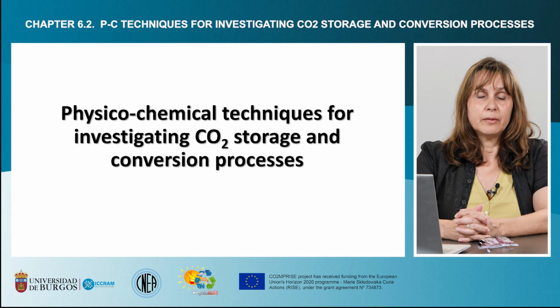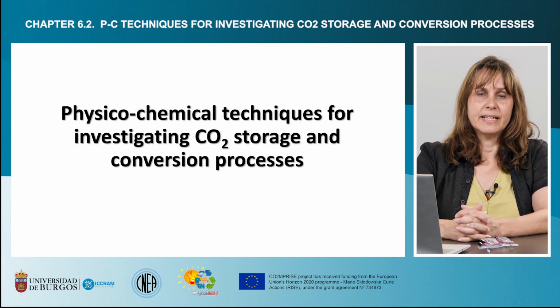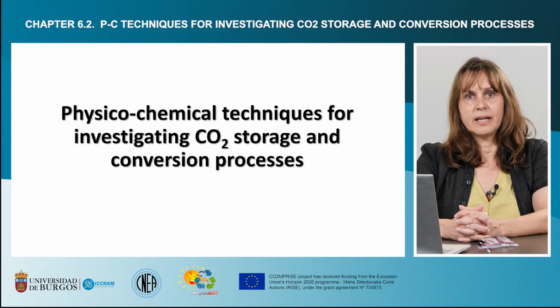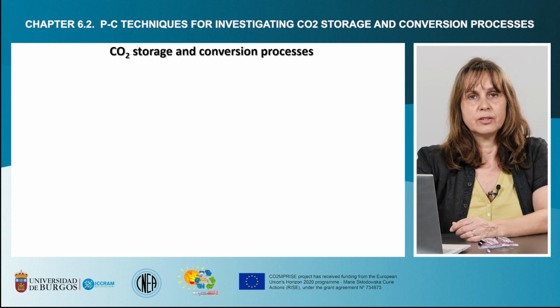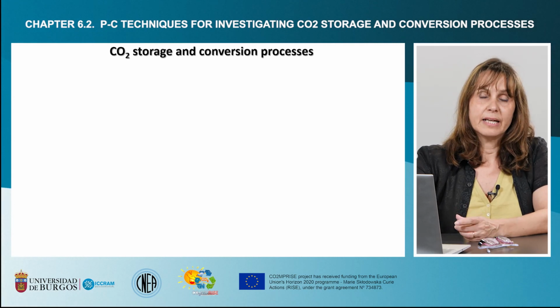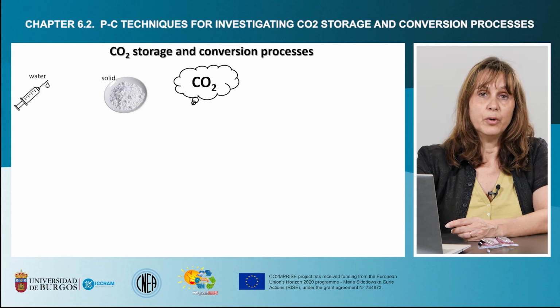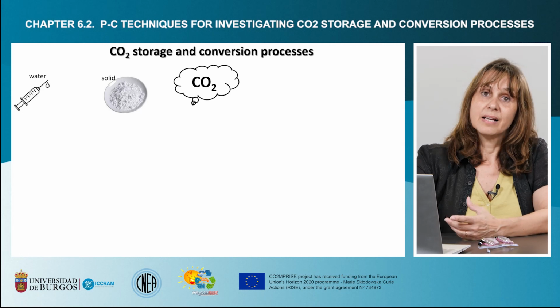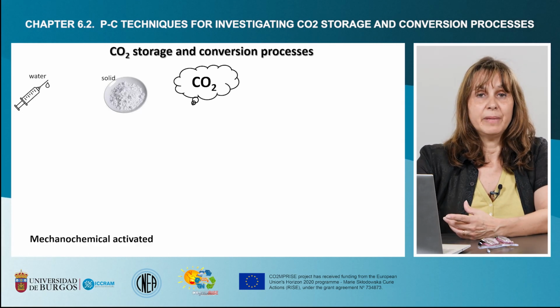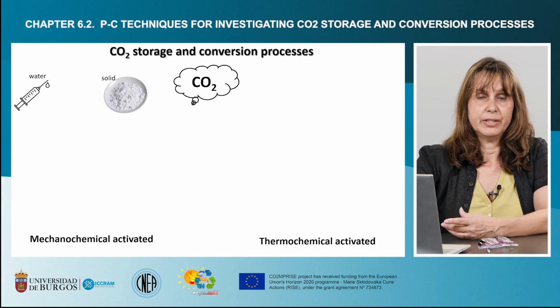I will speak about different physico-chemical techniques used for investigating carbon dioxide capture and carbon dioxide conversion. In particular, this type of reaction occurs between carbon dioxide gas and a solid or a liquid in different processes, some activated by mechanochemical energy and others activated by thermal energy.